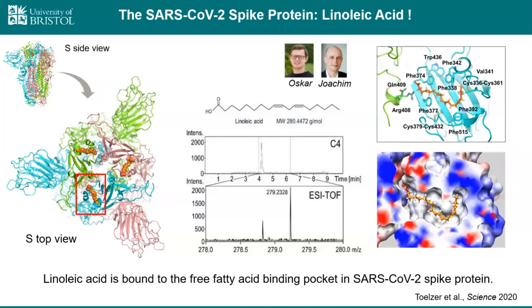And we have now also really nice MD simulations from Martin Frank showing how linoleic acid can bind into that pocket and make this pocket opening. So as I said, the majority of our particles were linoleic acid bound, 70%, but 30% of the particles were in an open conformation, and the first spike structure we had was not of sufficient resolution to decide whether there's any LA in there or not.